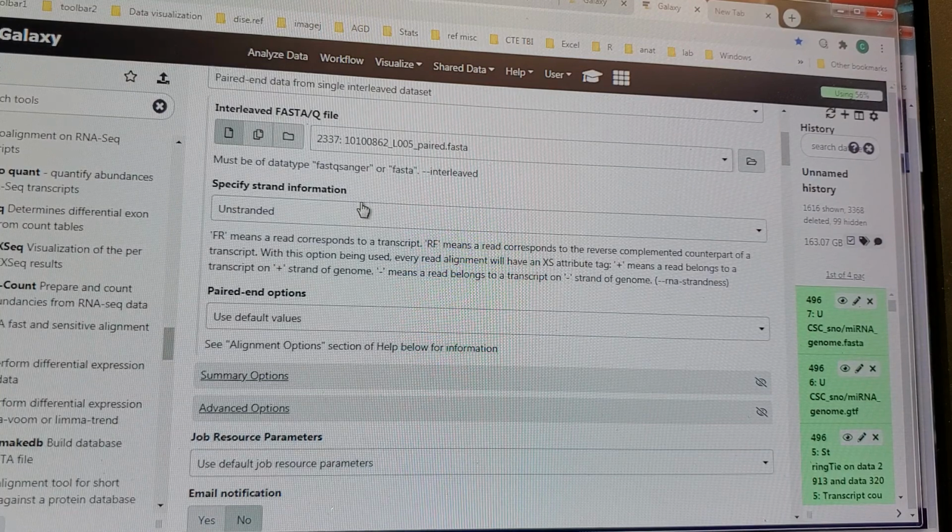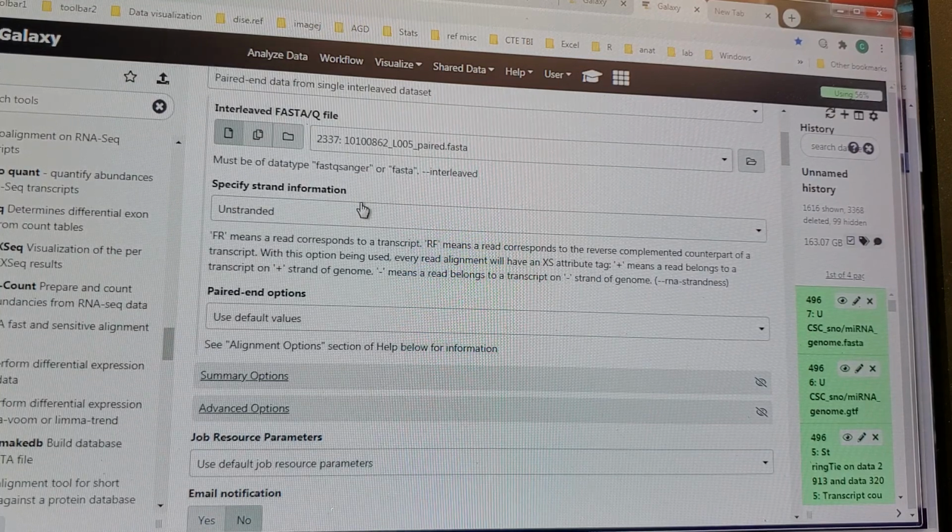You may run into situations where it's not true, like if you need all of the data possible and you have to end up working with low quality sequences, but you want to penalize them when you're mapping or doing whatever, like K-mer search or BLAST, then you might work with FASTQ files, but for now we're just going to work with FASTA files, which is just the sequence and the name.